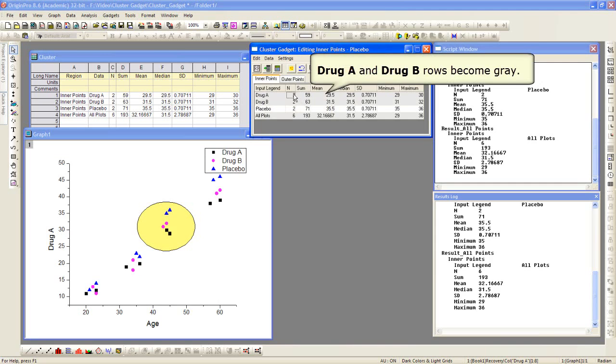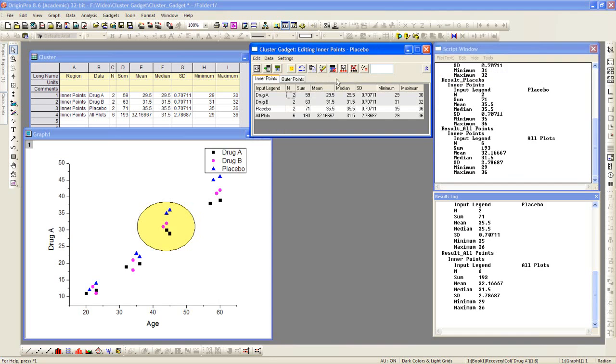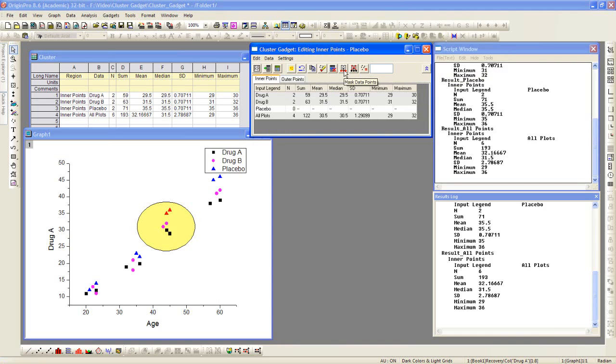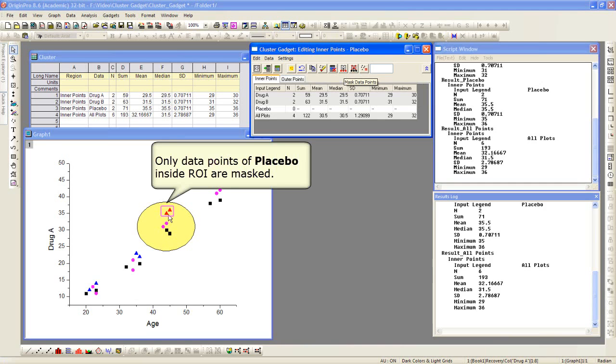So the only one that is active, it's kind of highlighted there in white, it's not grayed out, is the placebo. I can now click the mask data points button and click on points inside the ROI box, and it will mask just those placebo data points.